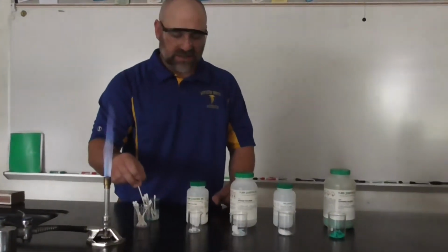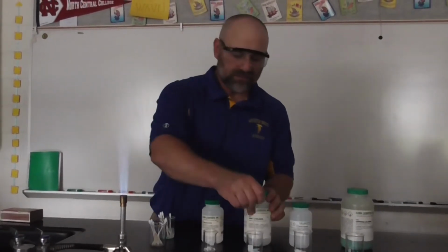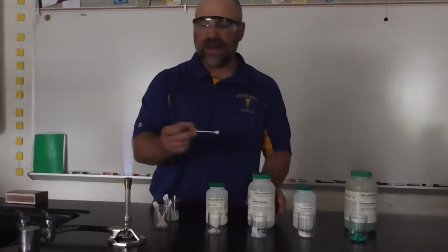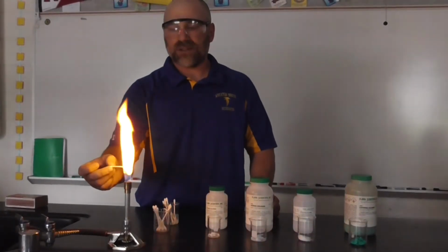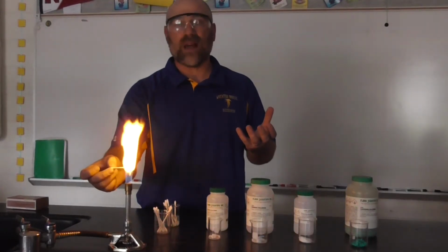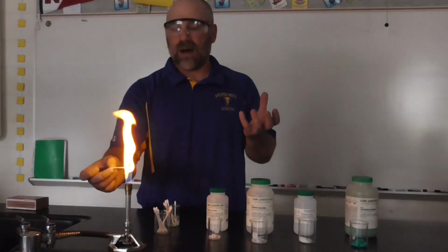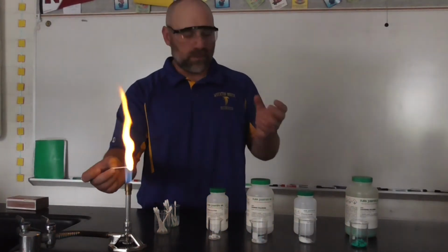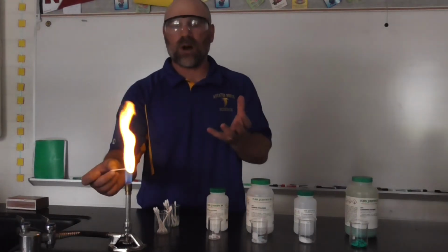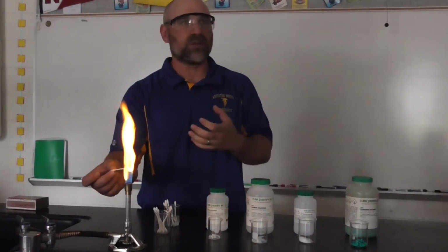Each element is going to have a different signature. This one, for example, is sodium chloride, table salt. Sodium chloride is actually a very bright emitter of light within the yellow range. This is why certain street lights use sodium gas vapor, because it's a very bright light and so it's an excellent emitter. If you were to mix sodium with one of these other salts, you would primarily see only yellow, because it emits so many photons in that yellow range of the visible spectrum that it would drown out the others.